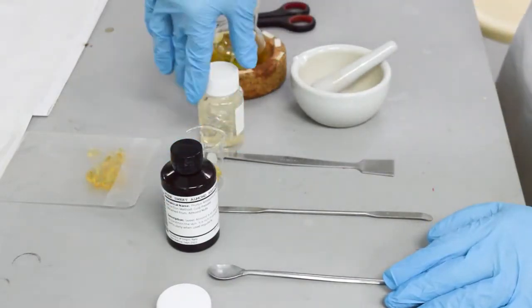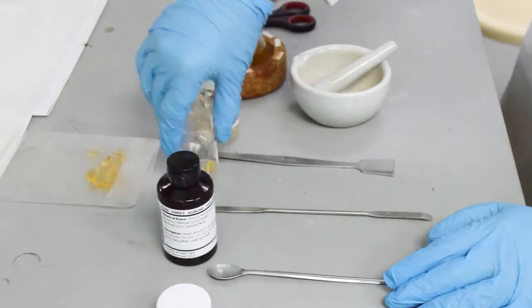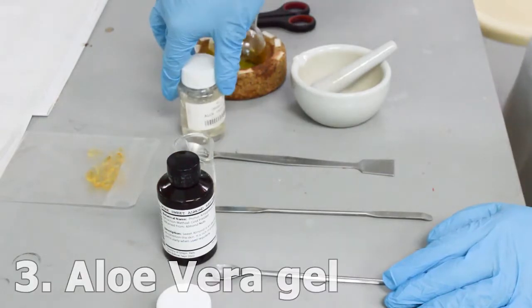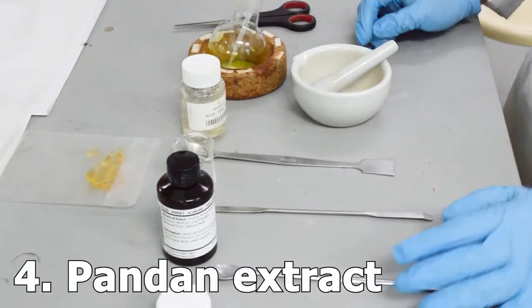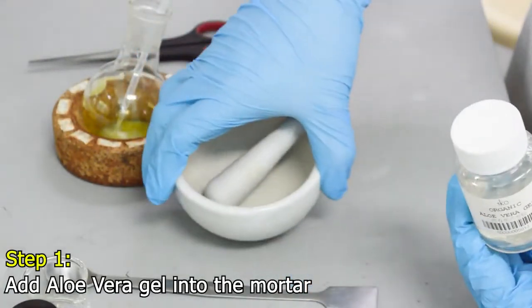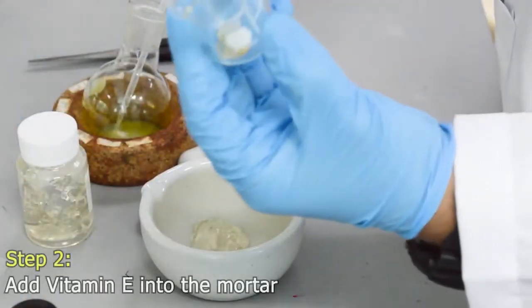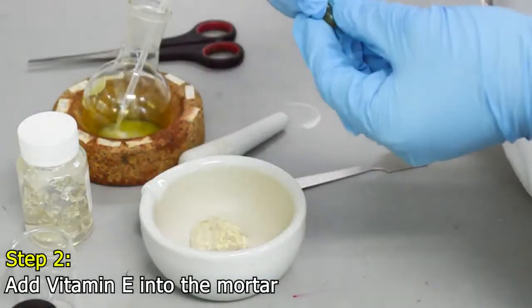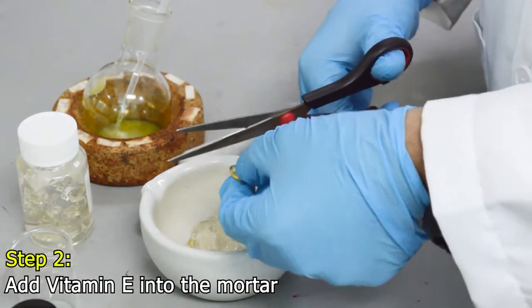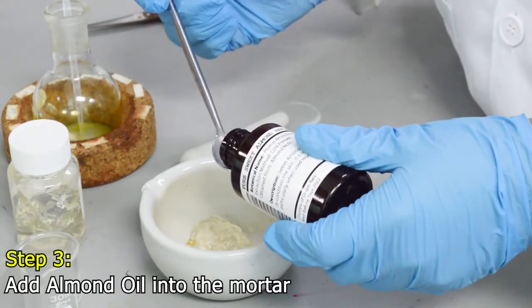Now I want to show you the preparation of the body lotion. The ingredients needed are almond oil, vitamin E capsules, aloe vera gel, and the pandan extract. First, I will add the aloe vera gel into the mortar and pestle. Next, we'll open two vitamin E capsules using scissors and put all the contents inside, then add the almond oil.